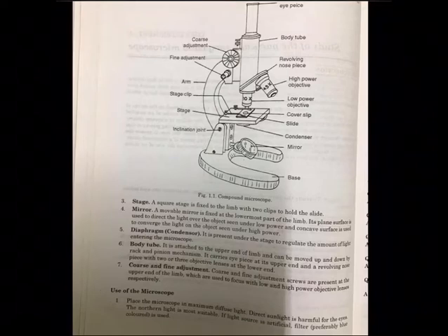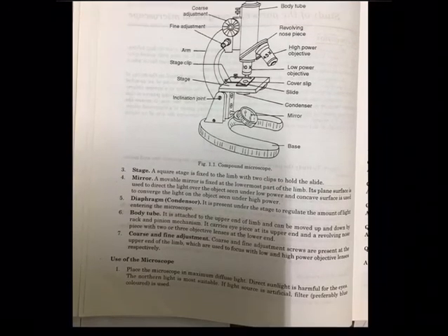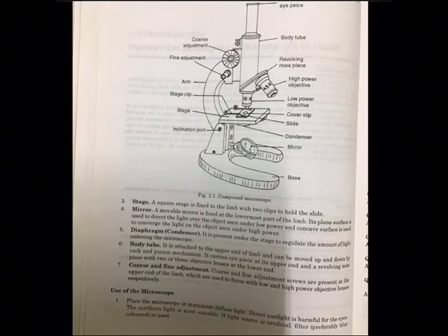So, care must be taken that whenever you are placing the microscope, you must place it in diffuse light, source of light. Direct sunlight is harmful for the eyes. The northern light is most suitable. If light sources are artificial, a filter, preferably blue colored, is used. Adjust the light by turning the mirror towards the source of light and also by moving the condenser.